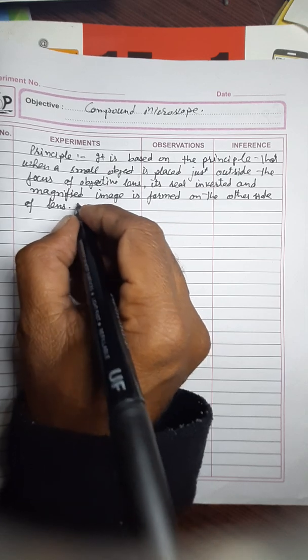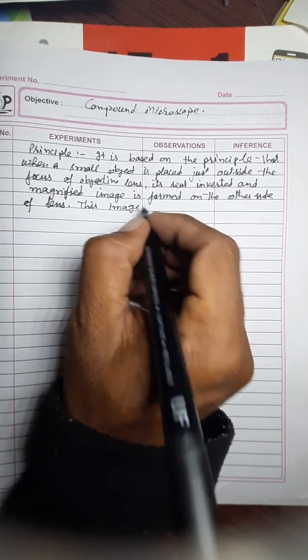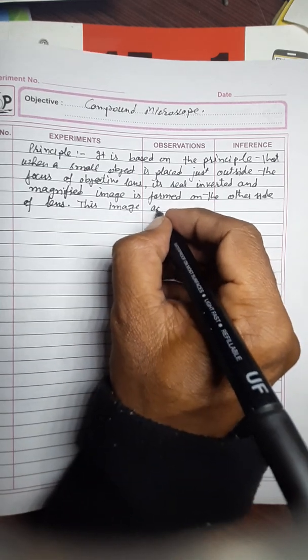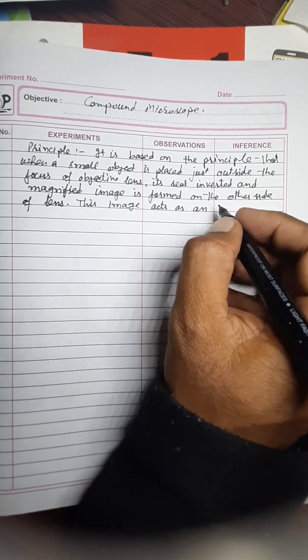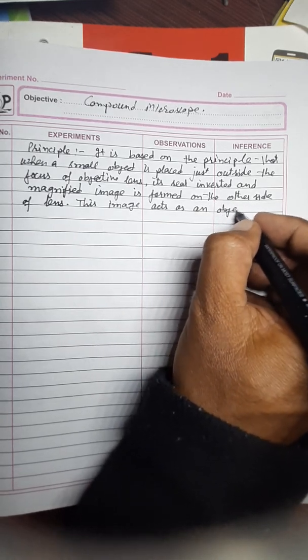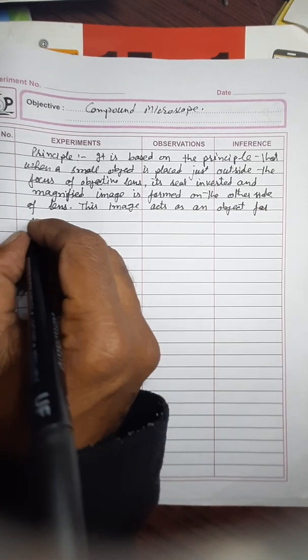This image acts as an object for the eye lens.